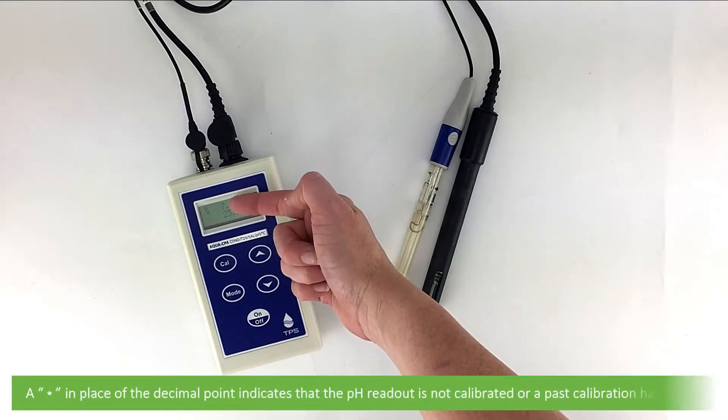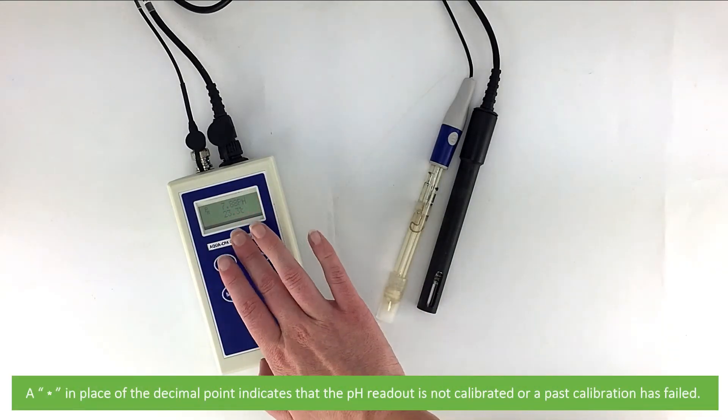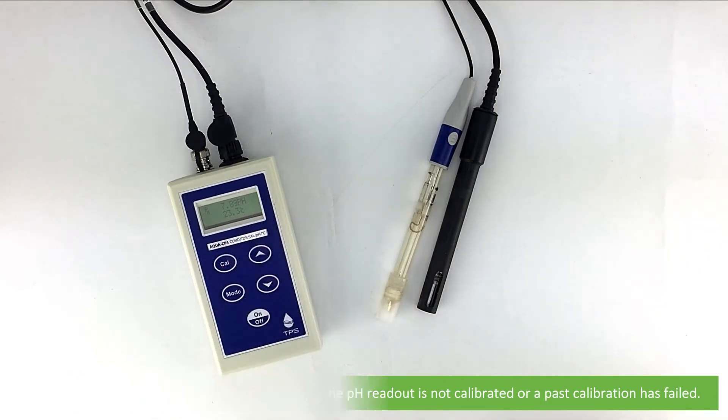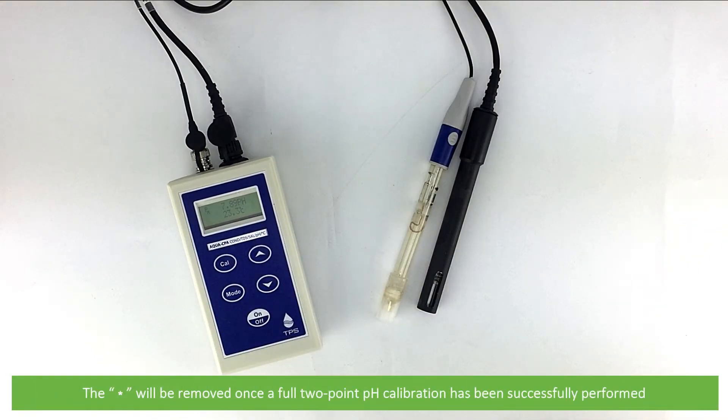An asterisk in place of the decimal point indicates that the pH readout is not calibrated or that a past calibration has failed. The asterisk will be removed once a full two-point calibration has been successfully performed.